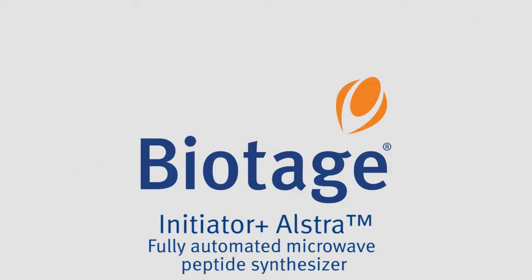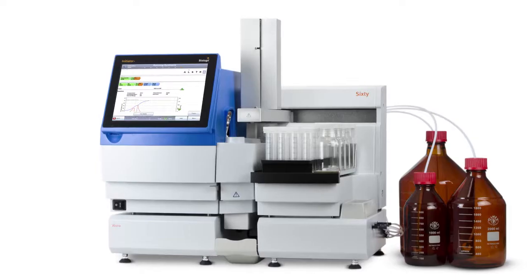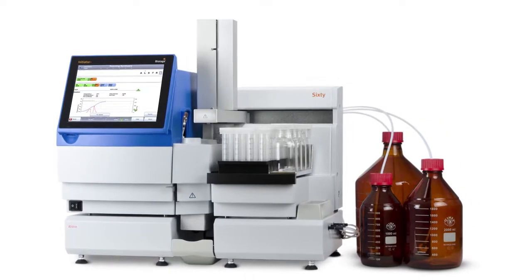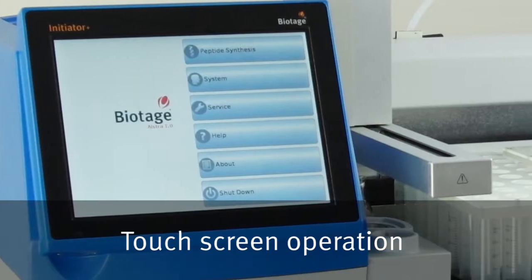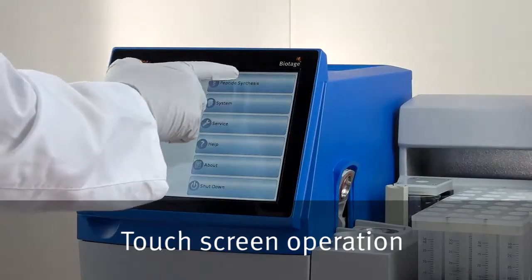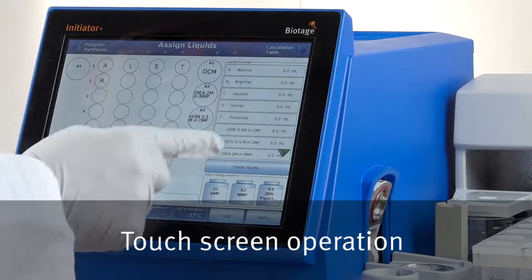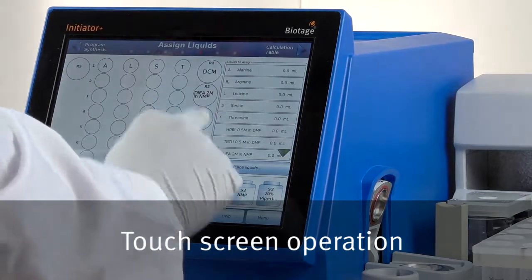The Biotage Initiator Alstra system is a fully automated microwave peptide synthesizer. The system is programmed via the large 10-inch touchscreen with drag-and-drop capability, which is tablet-like in operation.